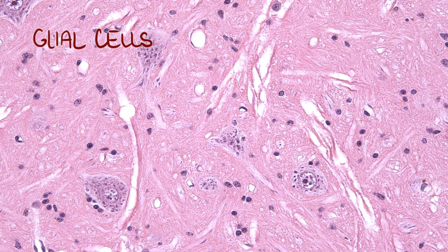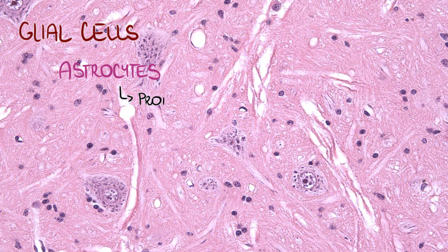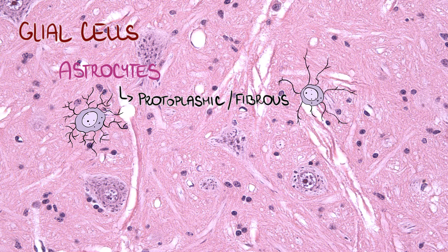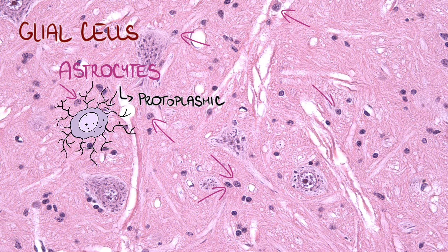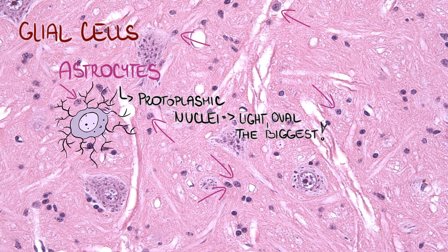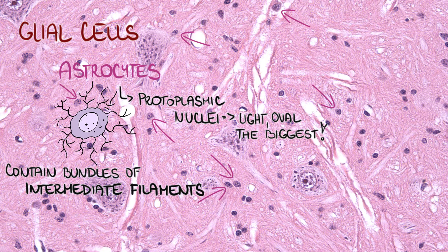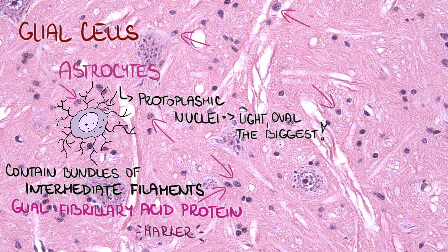Let's start with astrocytes. We distinguish protoplasmic and fibrous astrocytes. These are the nuclei of protoplasmic astrocytes in gray matter. Their nuclei are light, oval, and the biggest of all glial cells. Astrocytes contain bundles of intermediate filaments made up of glial fibrillary acidic protein, which serve as a unique marker for these glial cells in pathology. Their function is structural and metabolic support of neurons, especially at synapses.